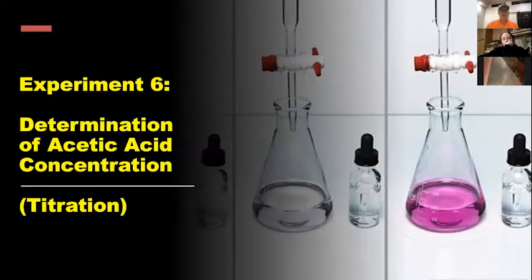Can anyone tell me, just based right here on the title, what is a titration? Because that's actually what you're going to be doing tonight. What does that mean? Anybody? Isn't it the equivalent amount of like the reactants being mixed?